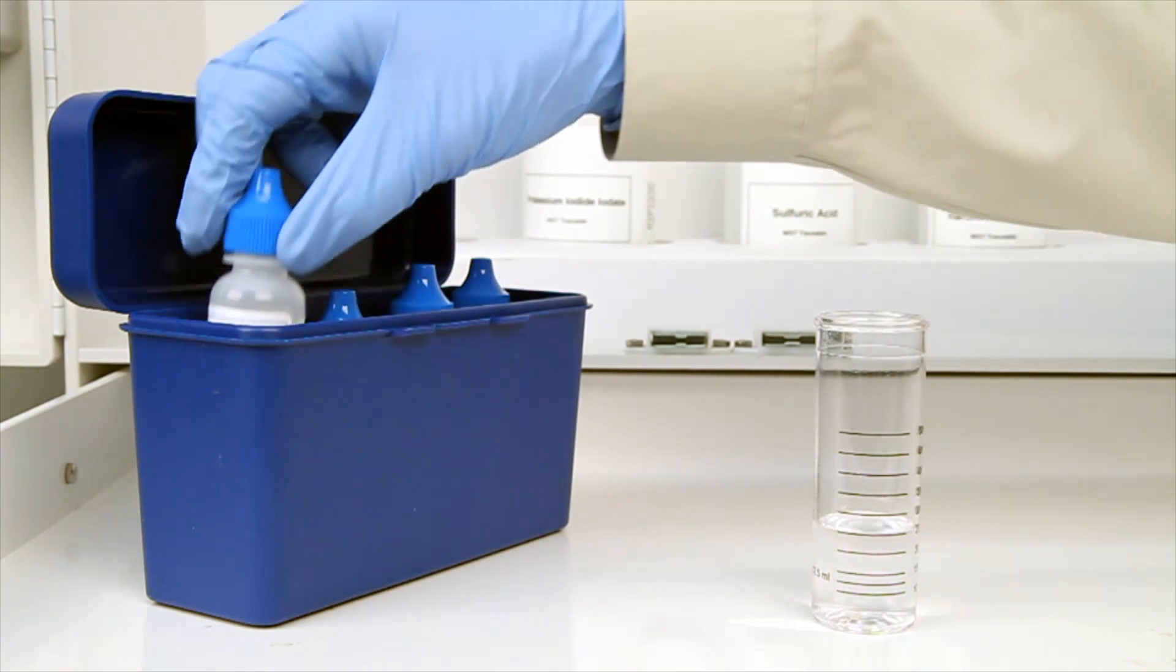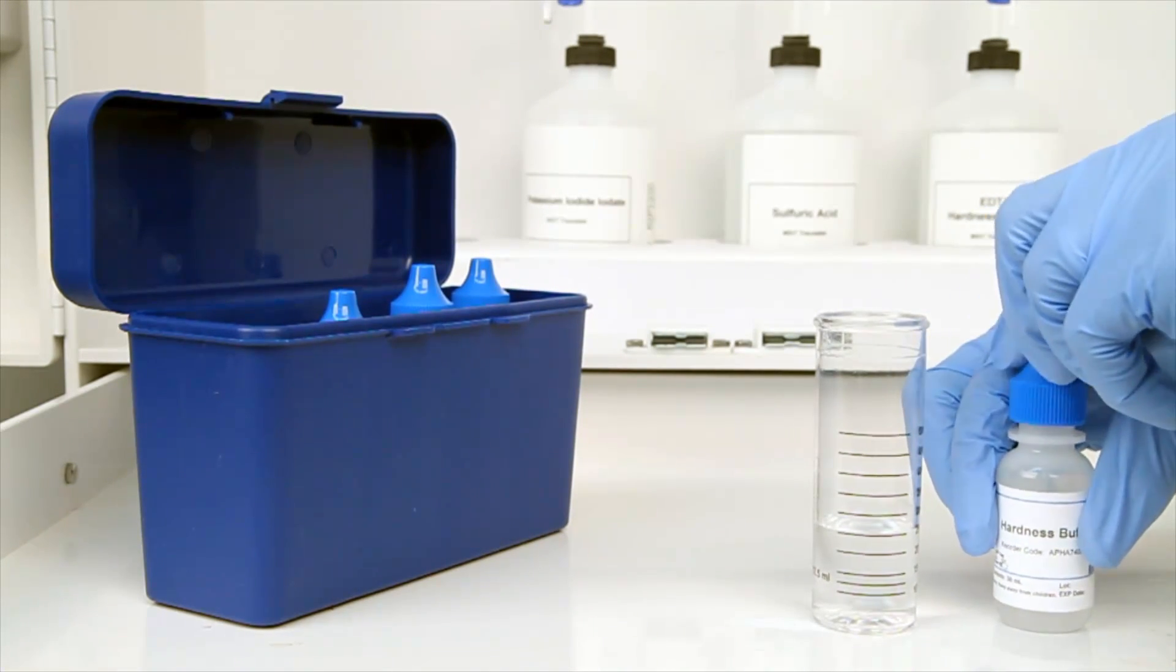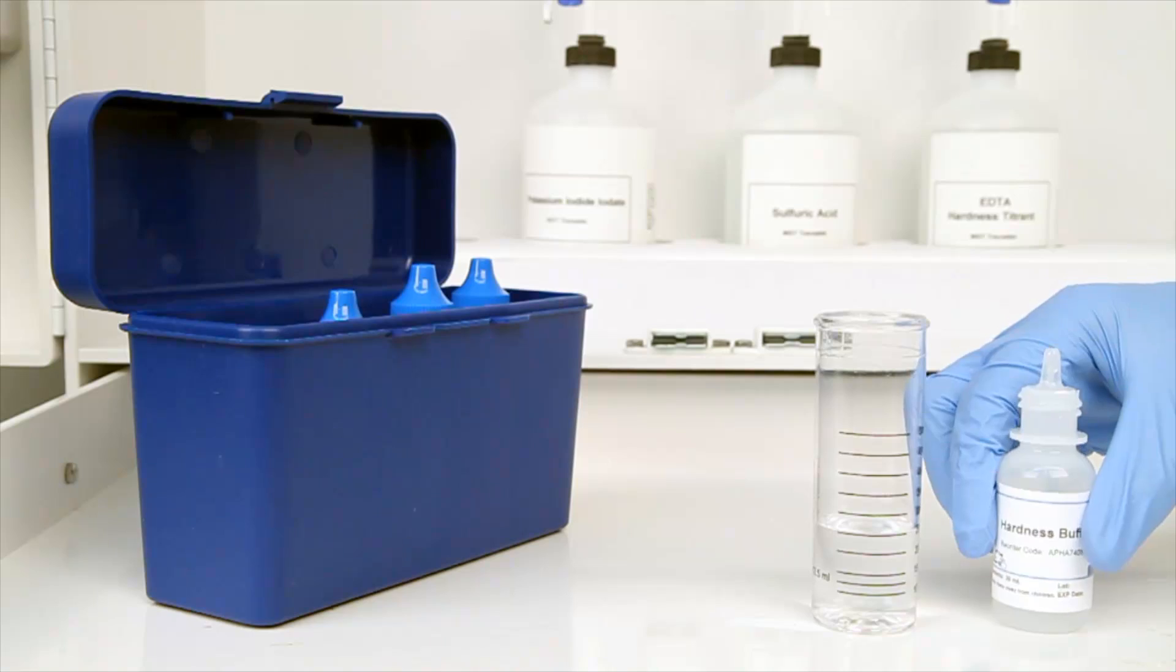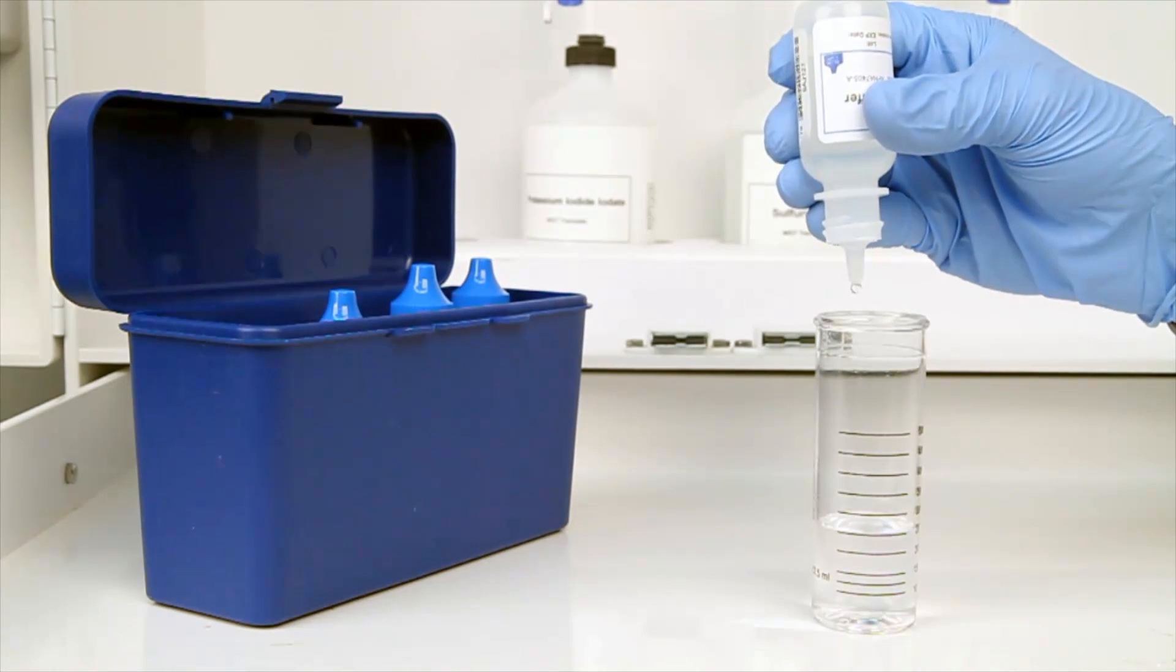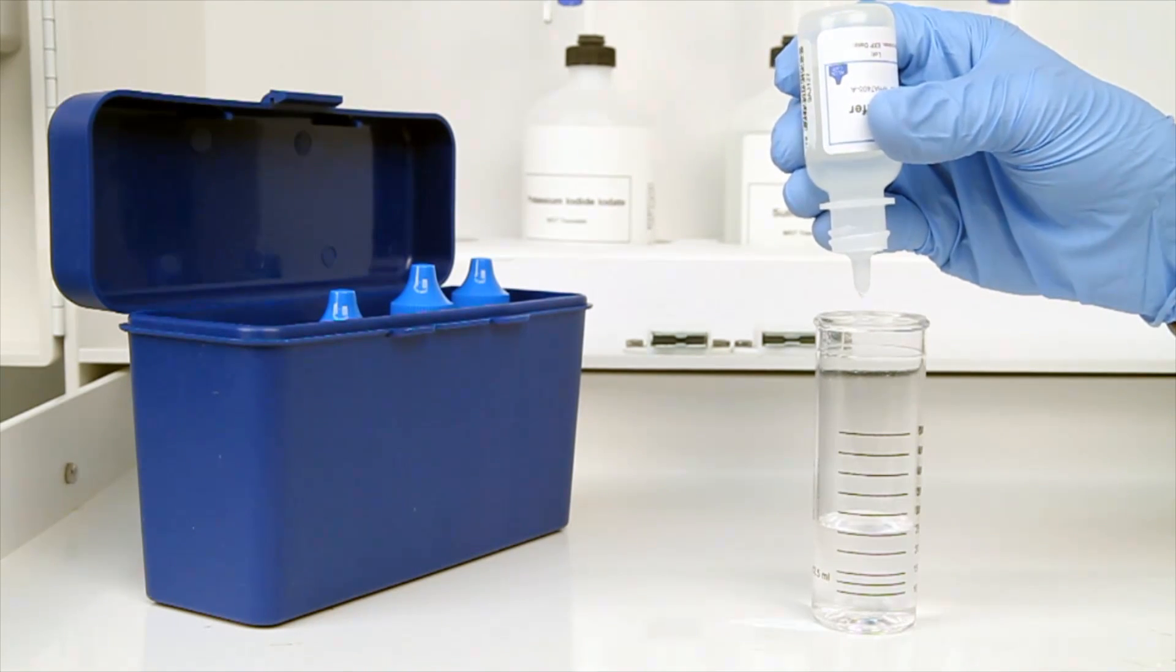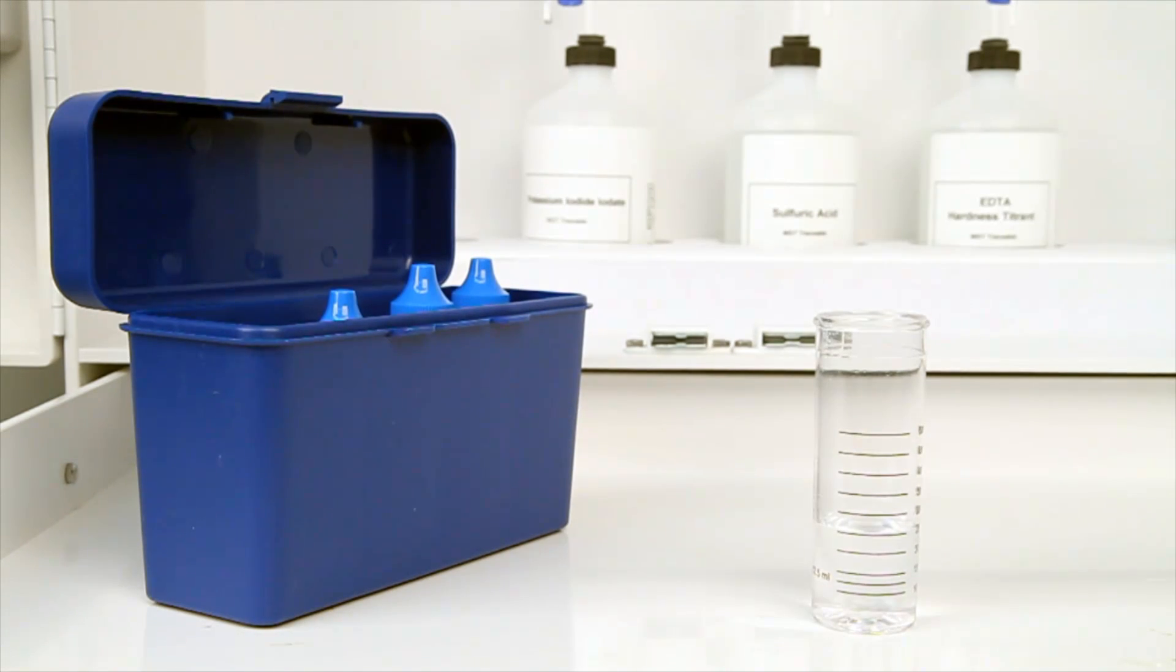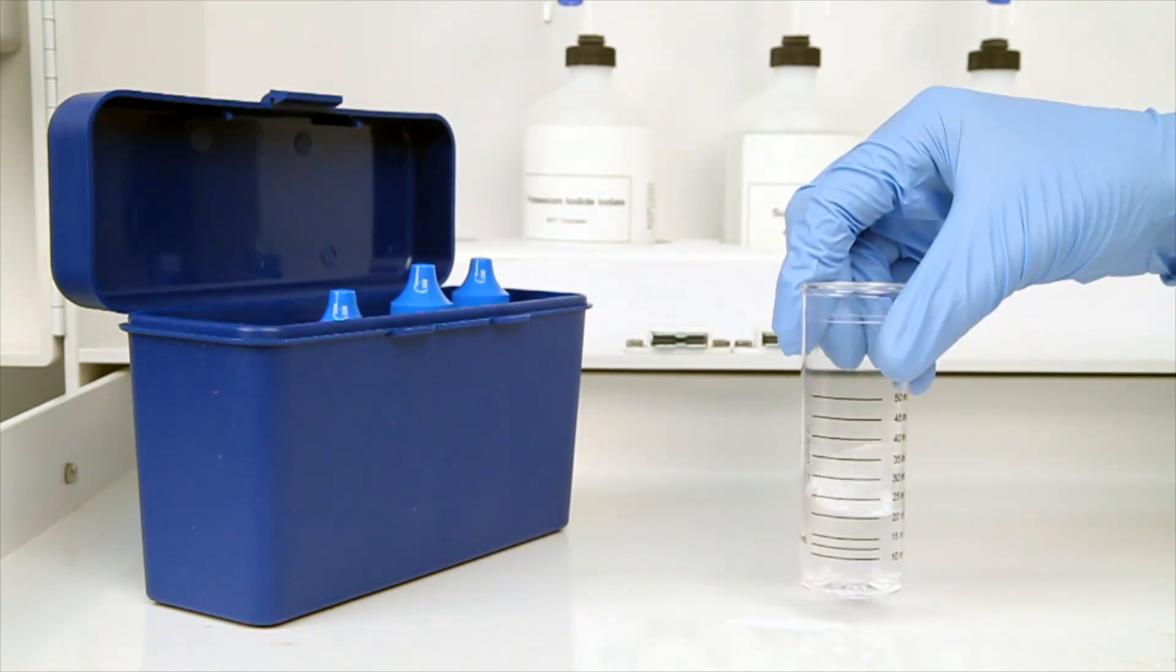The next step according to the Endpoint ID procedure is to add five drops of hardness buffer. Be sure to hold the bottle vertically to get a consistent drop size. Remember to swirl the vial after the addition of each reagent to make sure the reagents are properly mixed.